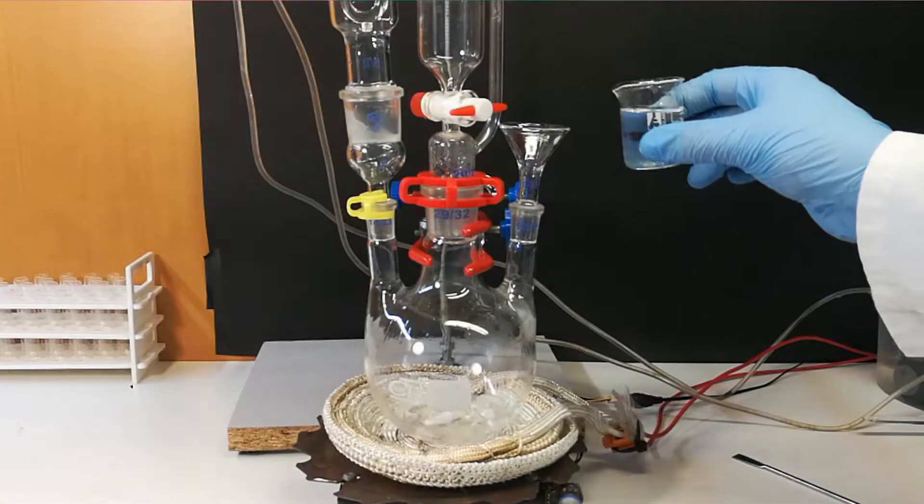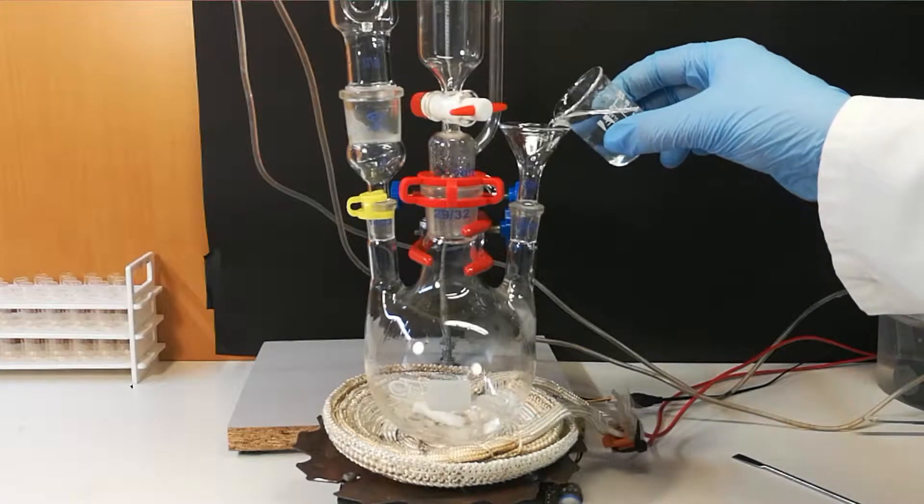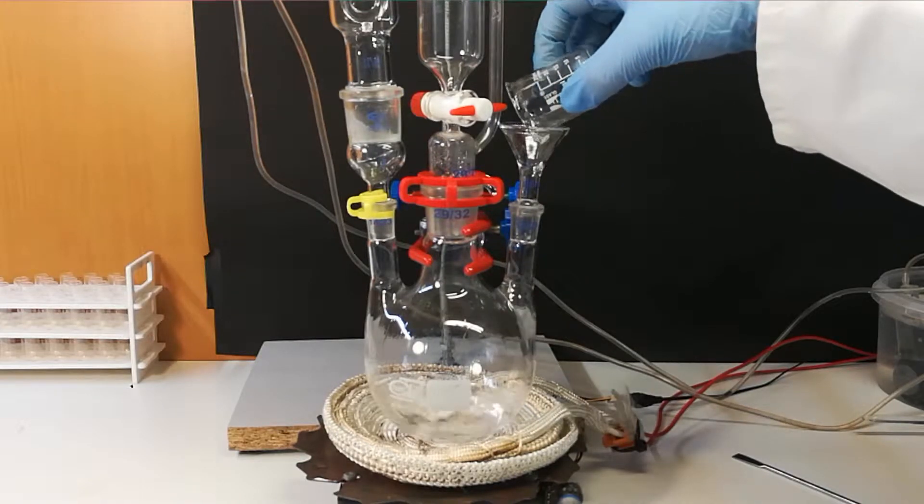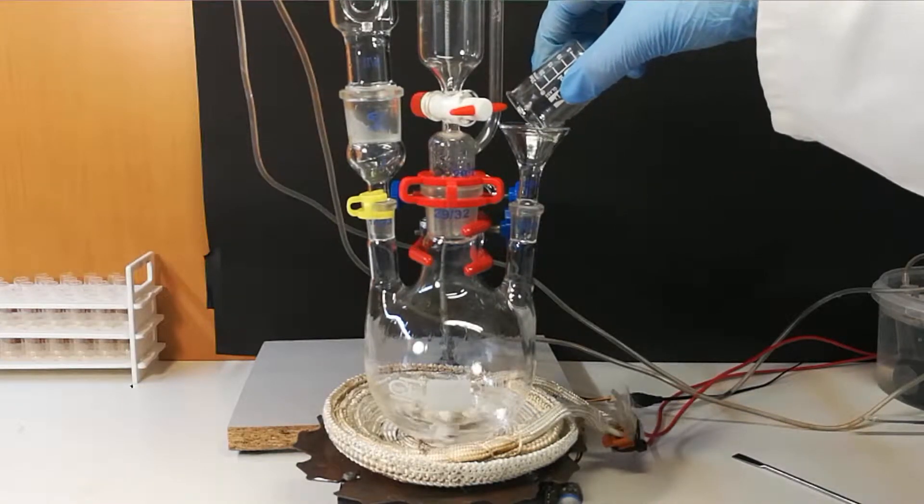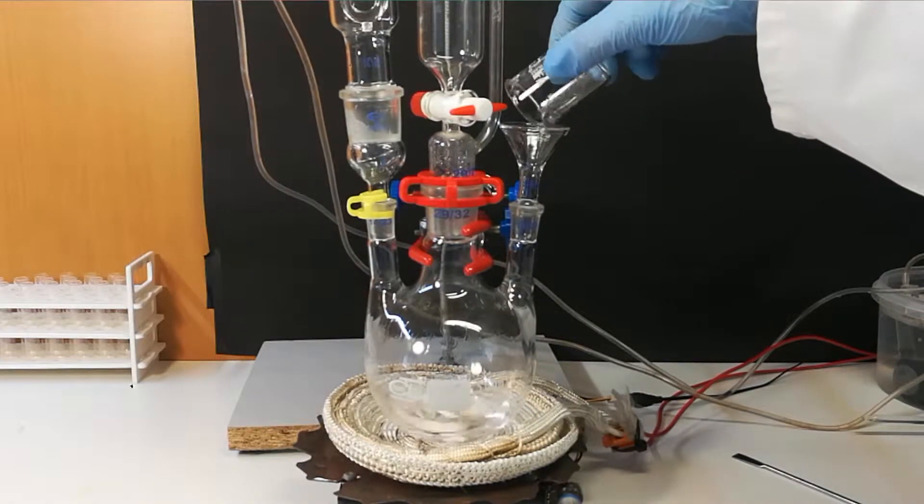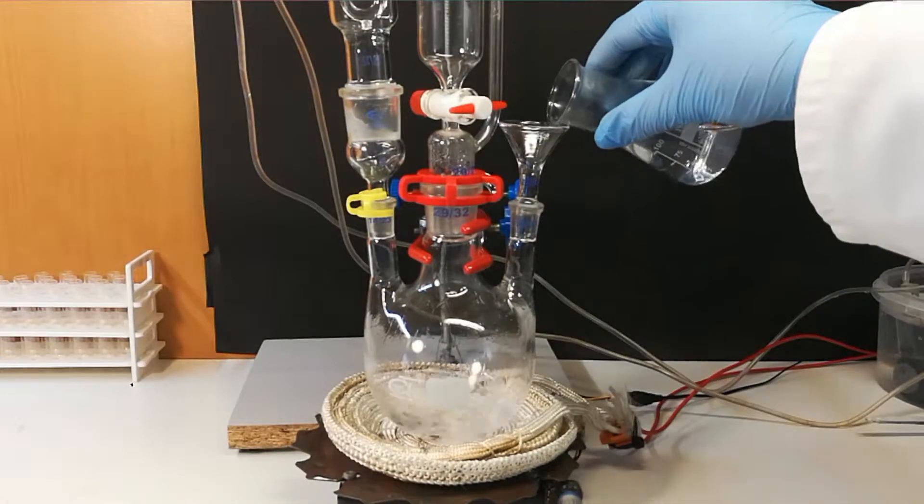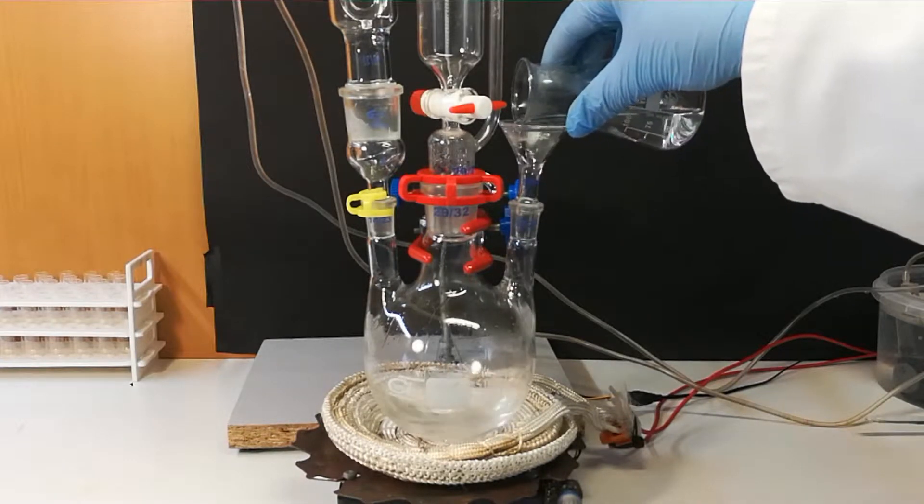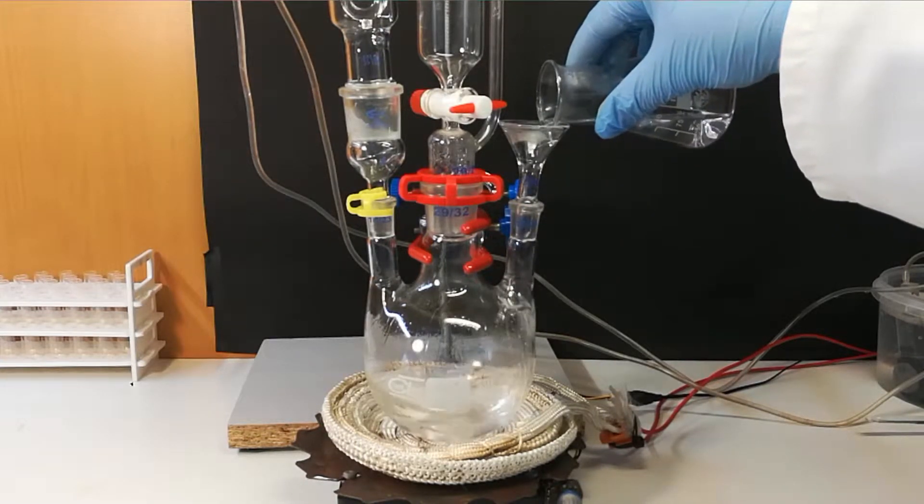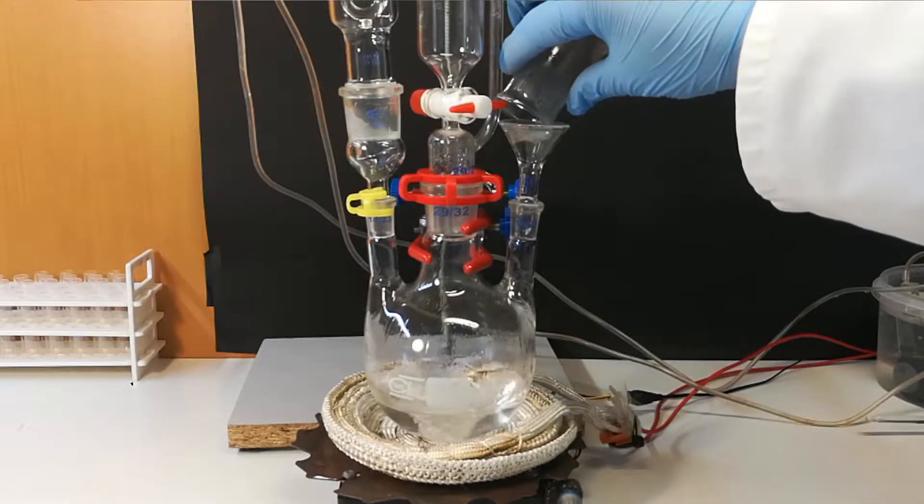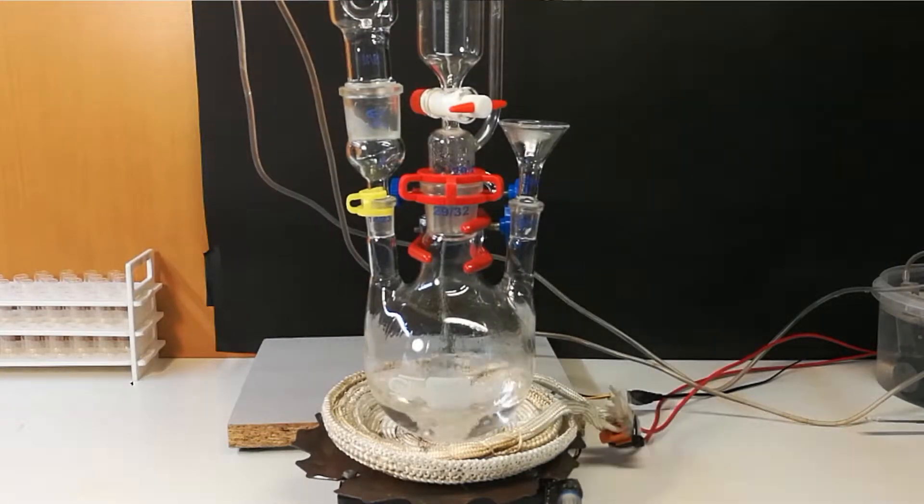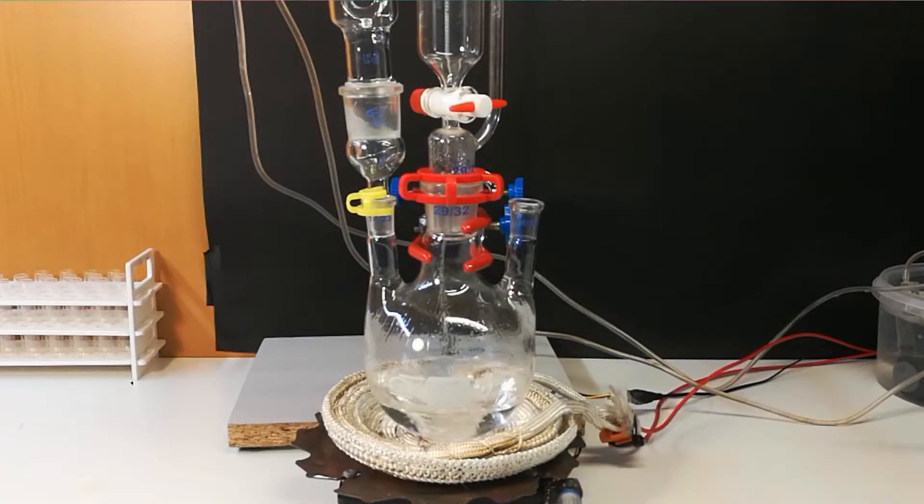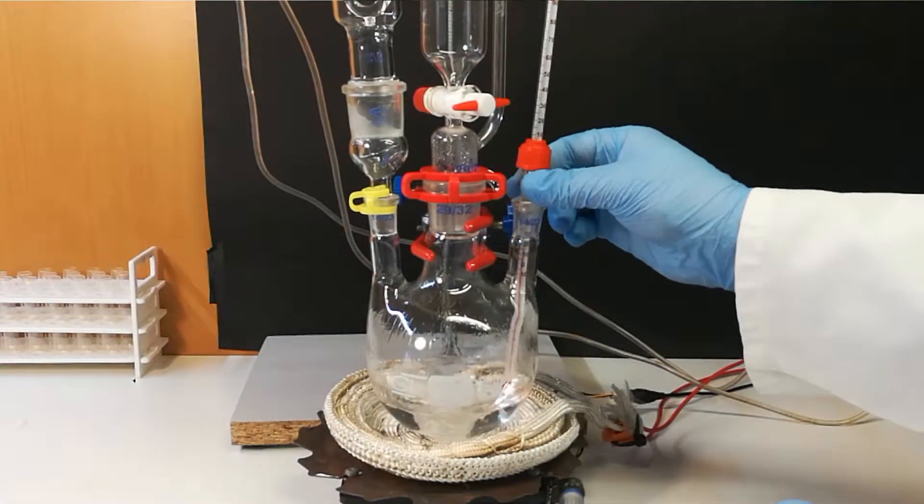Add both mixtures to apparatus containing dripping funnel and reflux condenser. Slowly add base, it generates heat. Close apparatus with thermometer.